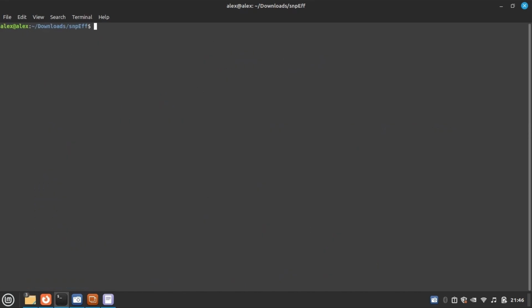You have to run java, then jar, then snpEff, and after that you have to write databases. It will show the databases.